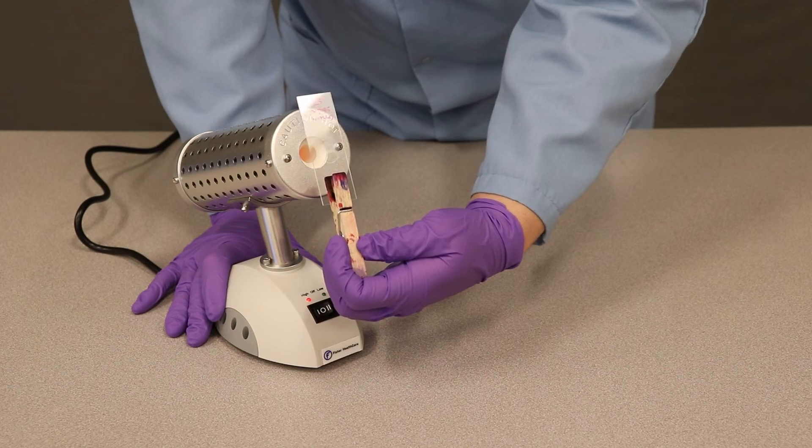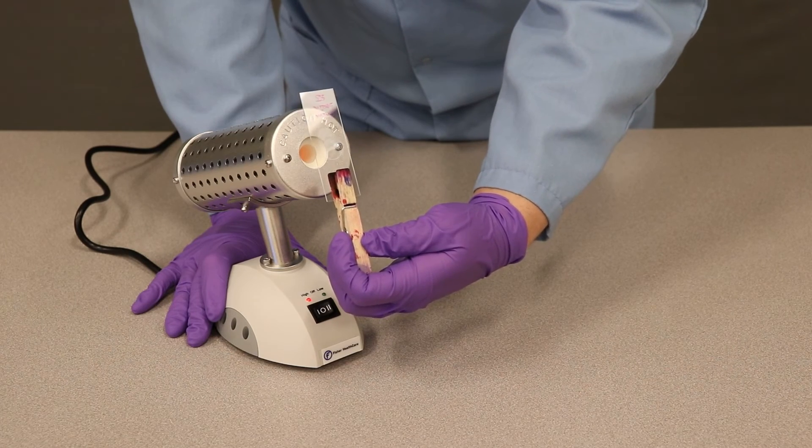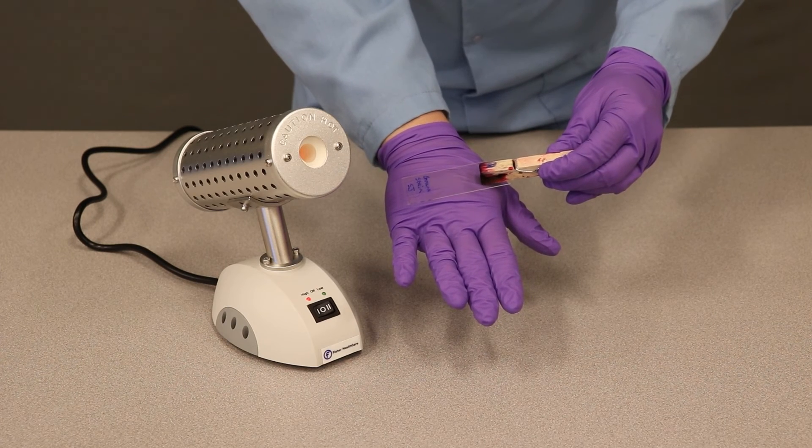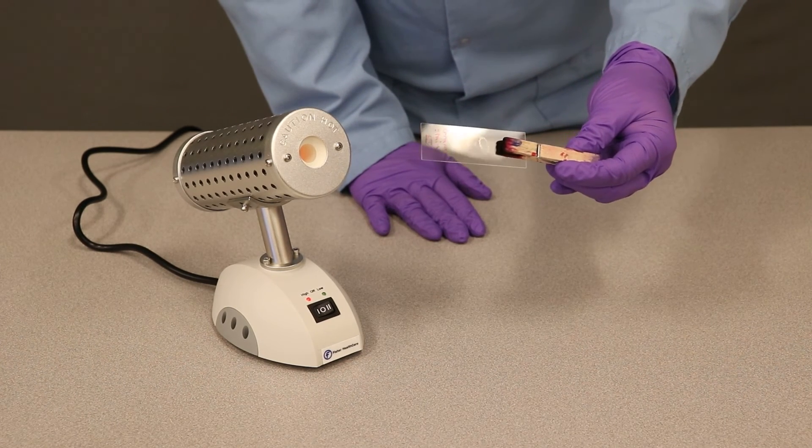When you think enough time has gone by, like when you heat fix with a Bunsen burner, you can place it gently on the back of your hand. If it's hot but not burning, then you know it's been properly heat fixed.